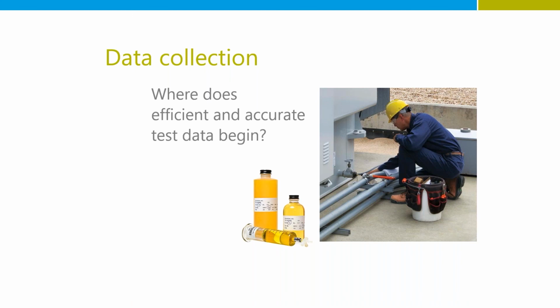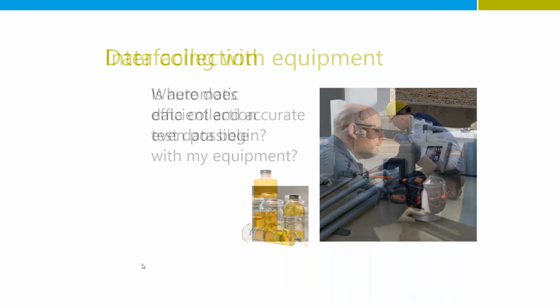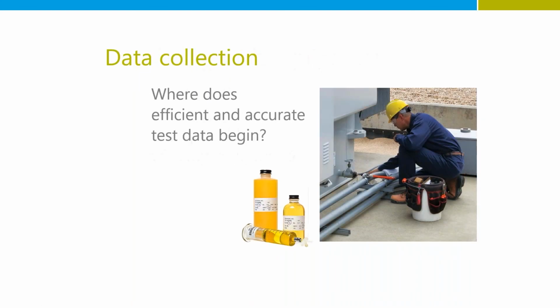So for example, if you're a laboratory that does sampling and testing of transformer oil, there's going to be additional data points that you need to look at and you need to maintain and collect in the same efficient way that you do the sample information. That's extracurricular data points, which could be weather or whatever else you can find. It's always good to try to find as much data as possible so that you can increase or enhance your analysis in the future moving forward.